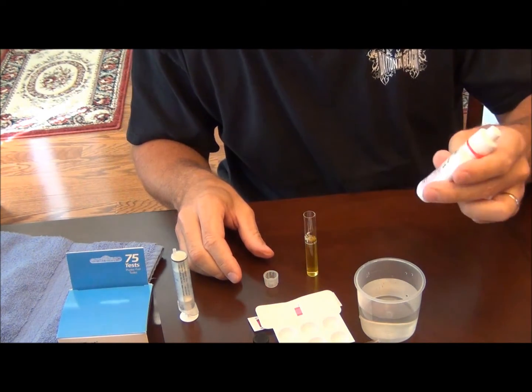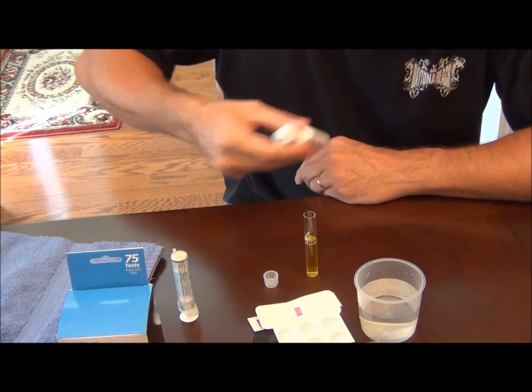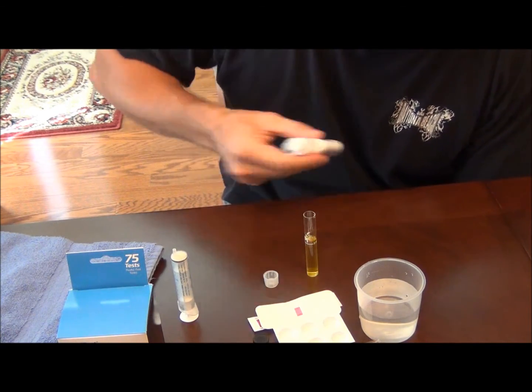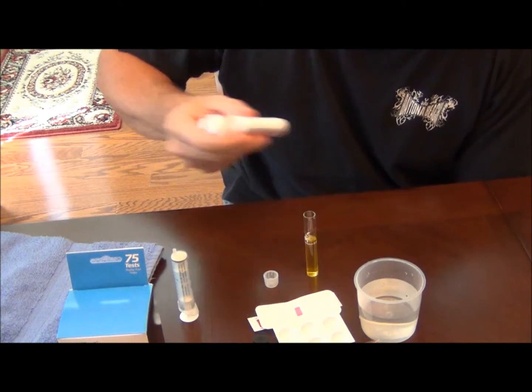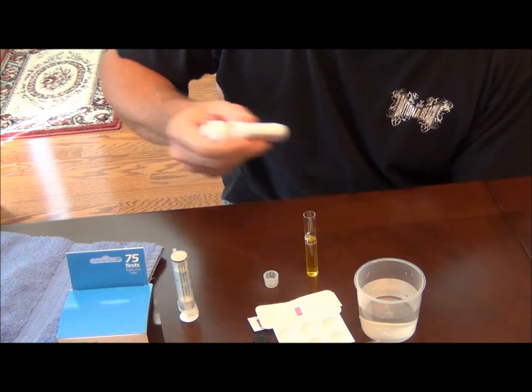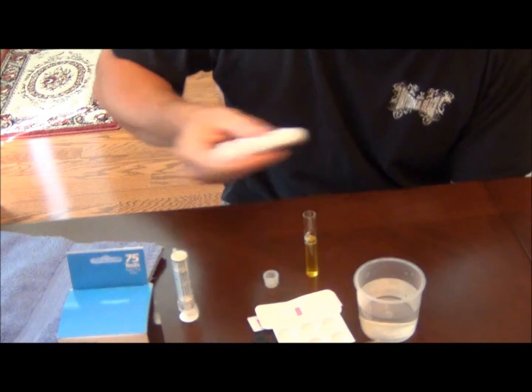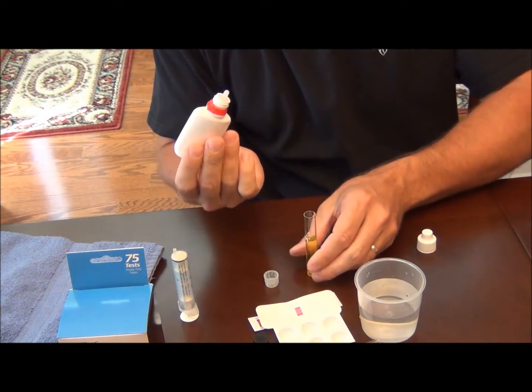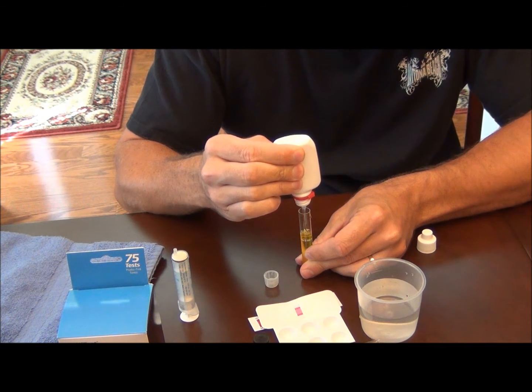Now take solution number two. It's very important to shake this vigorously for 30 seconds. Add 10 drops of solution number two, holding the dropper bottle vertical — 1, 2, 3, 4, 5, 6, 7, 8, 9, 10.